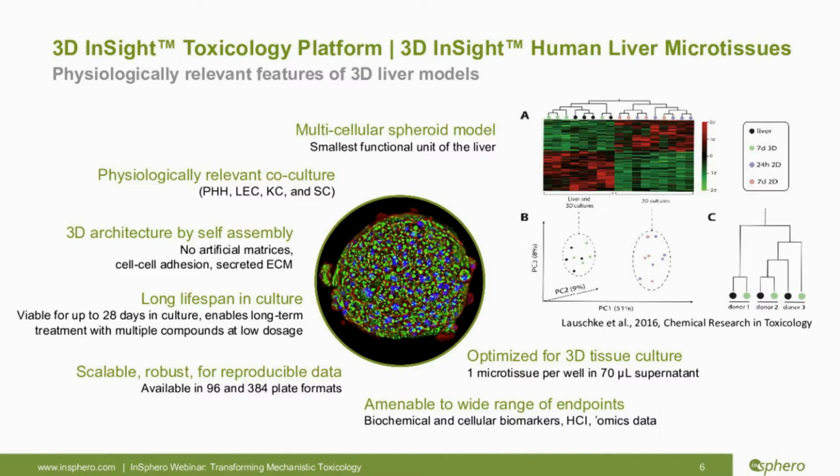One particular feature of these spheroids makes them so attractive. It's the longevity of the cultures and the possibility to do multiple treatments, culturing cells over a period of time after daily treatment, according to the particular clinical setting which you are aiming for with a drug compound. That gives completely new results in terms of the treatment schedule, and the outcome is also fascinating.